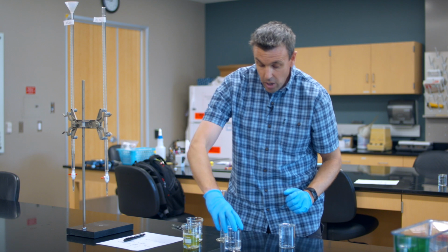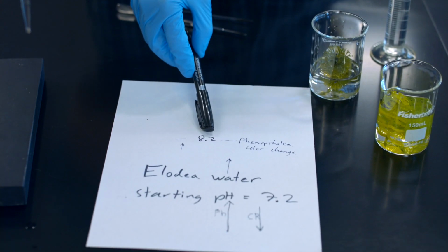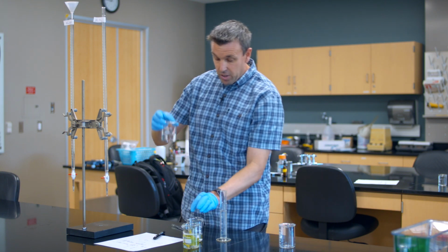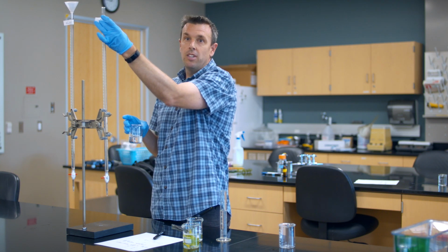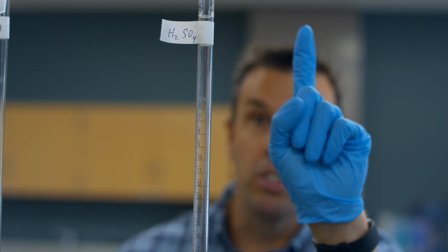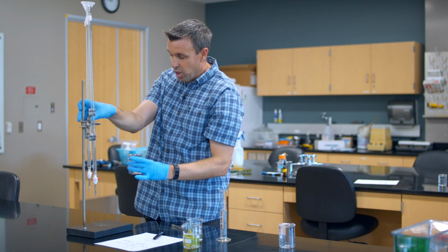And then at the end, we are going to take those beakers and we are going to titrate to see how much volume it takes to bring us to 8.2 where it turns pink. So let's think about this for a second. We are coming up in pH now. So do I want to use my acid like I did for the fish? Well, acid is going to bring the pH down. This time I need to go up to 8.2. So I'm not going to use the acid. I am going to use the base to bring the pH up.